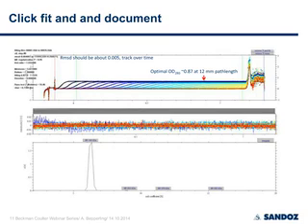So I use 0.87 as a target at 12 millimeter path length, and this gives you an optimal signal to noise ratio and also the maximum signal, because you want to see fractions of the total signal. So you should go as high as possible before the optics is not linear anymore and the noise starts getting higher. So this is, in my experience, the optimal OD.